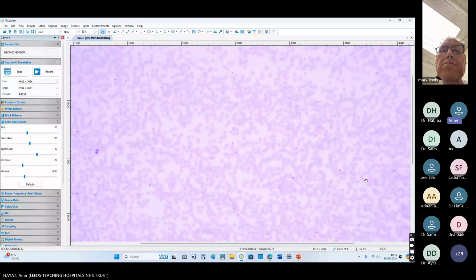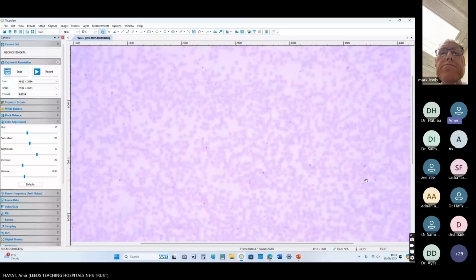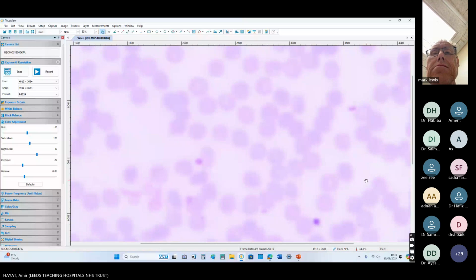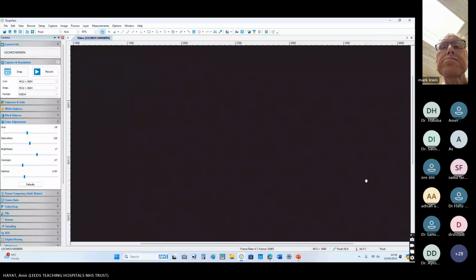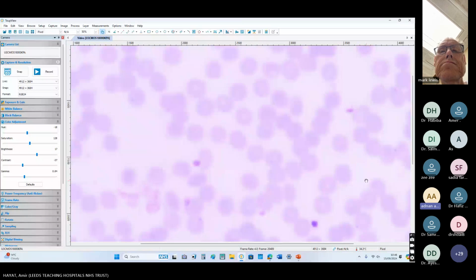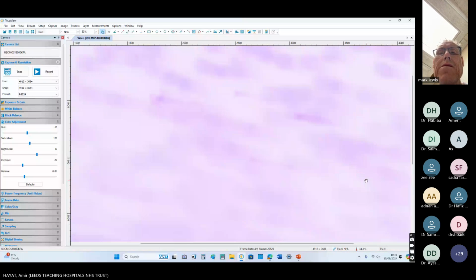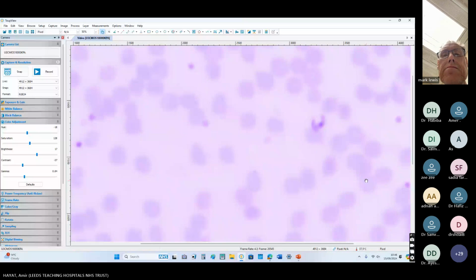For the exam purpose, if someone is coming from South America complaining of fever or difficulty swallowing, what do you think in your mind? Trypanosomiasis. Trypanosoma. Okay, so let's see if we have trypanosoma here or not. Yeah, could see. Trypanosoma could see. Yeah, so we have trypanosoma here.